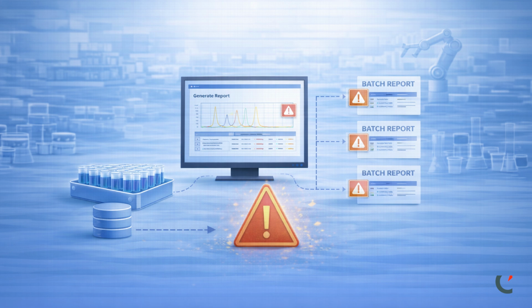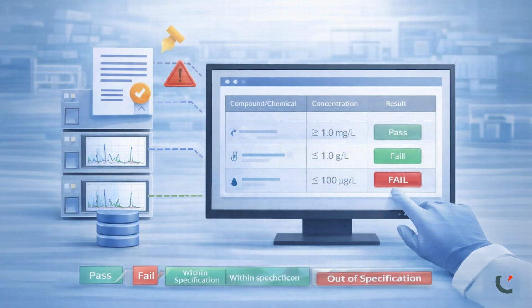This is particularly useful in routine or automated workflows, where large numbers of samples are processed and need to be checked against predefined criteria. Instead of manually reviewing each result, the system can automatically highlight or flag results that require attention. These features become especially powerful when used in batch processing workflows. When multiple samples are processed together, Chromperfect can automatically generate reports, apply formatting, and evaluate results using alarms. This creates a consistent and repeatable workflow where data is not only processed, but also reviewed and prepared for output with minimal user interaction.